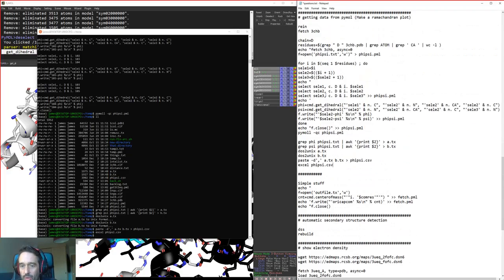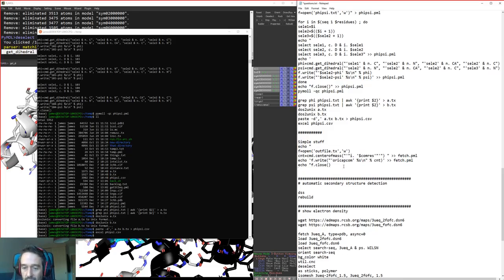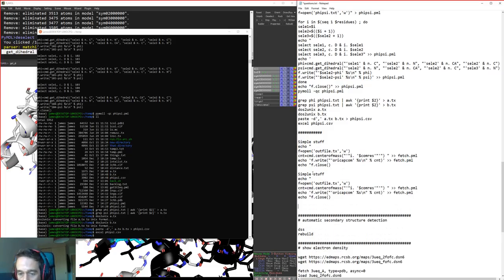If you don't want to have to go through all of this kind of palaver and you're just interested in taking some stuff straight out, I've also just simplified those commands here. So all that you really need to do is, in fact, I'll make it even simpler, because here I've put in my echo commands, so we can get rid of these and these and these.